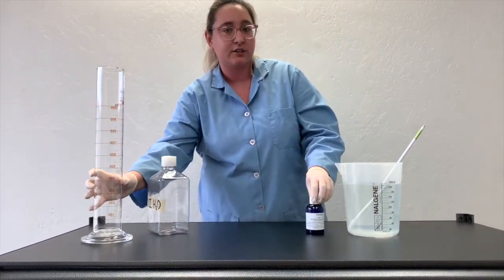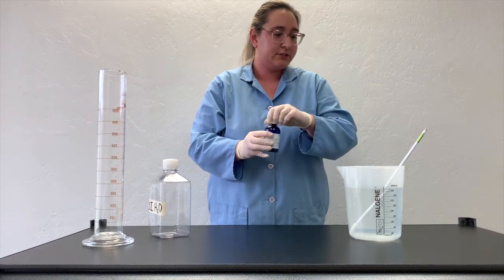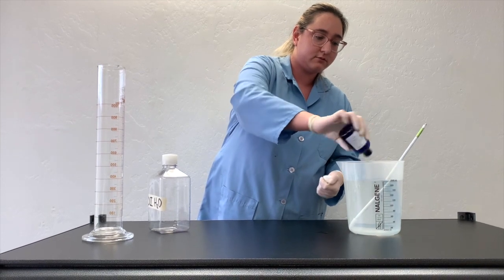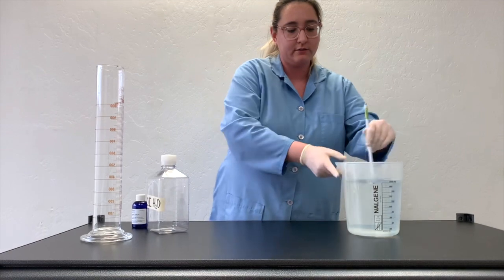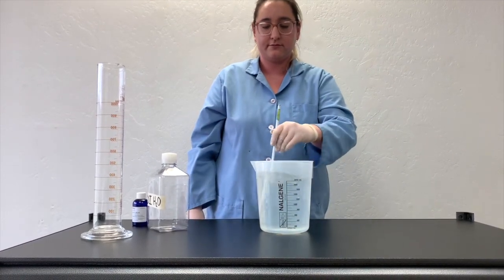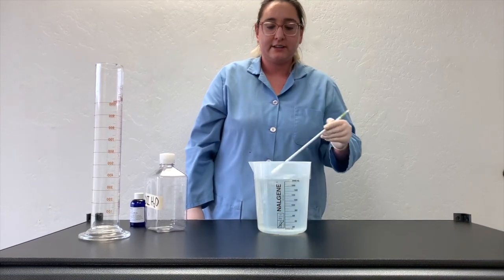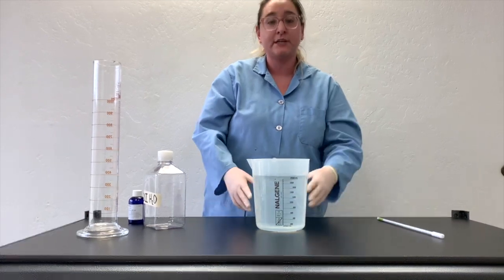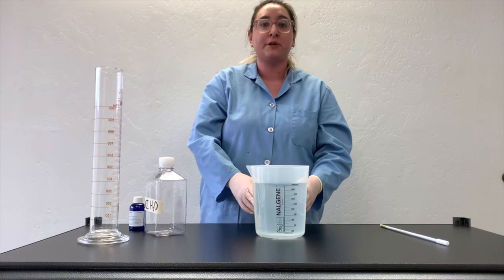And finally, we add our 20x TBE buffer, 100 milliliters, into the 1x TBE running buffer, ready to use with the Mini One electrophoresis system. Thank you.